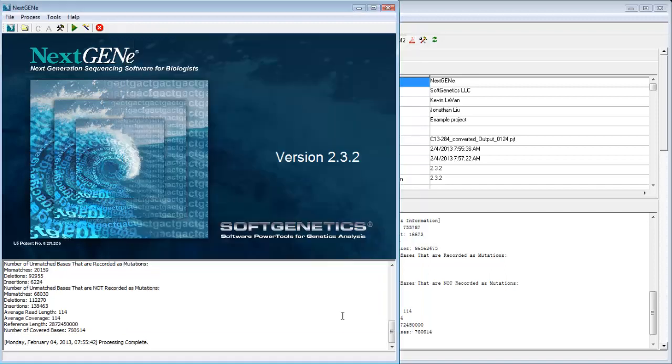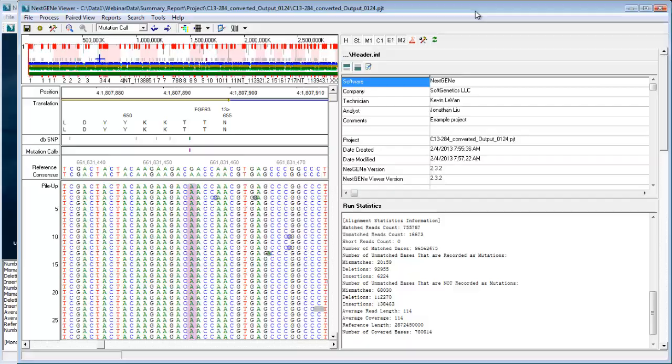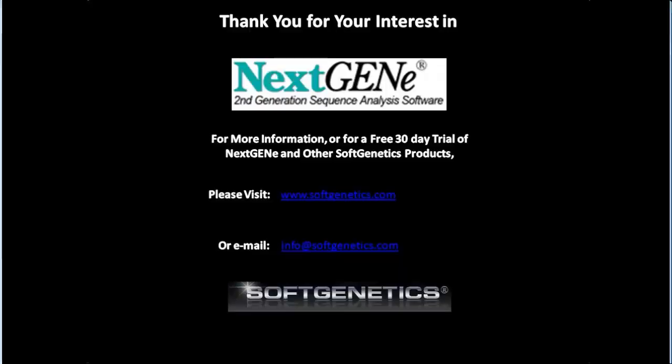So again, this is just a review of how you can use NextGene to create a summary report to include many different sections, including statistics, mutation calls, quality information, all in one report that can be saved as a PDF. Thank you for your time.